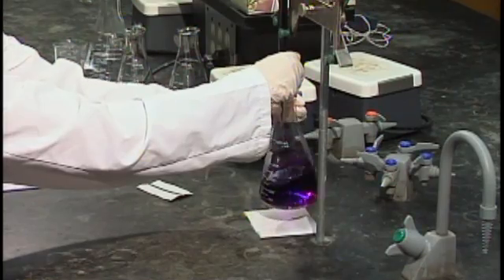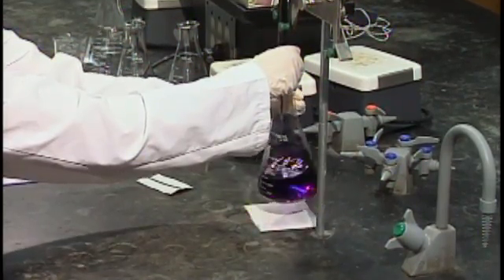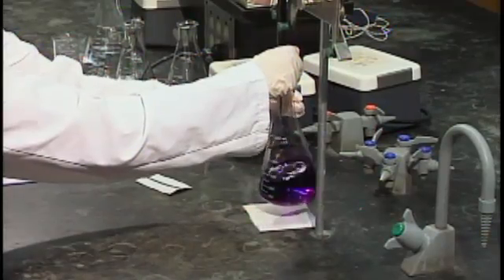And then once you add your 90% consumption of KMnO4, you can swirl your solution until it becomes colorless again.